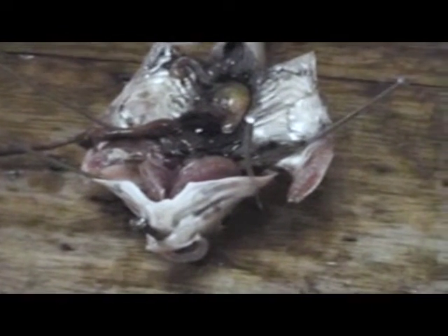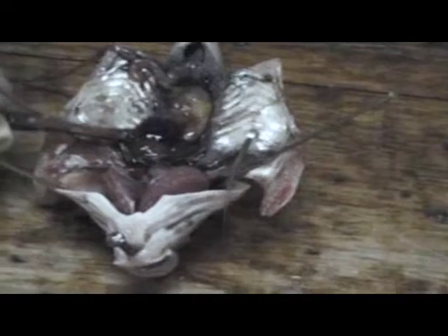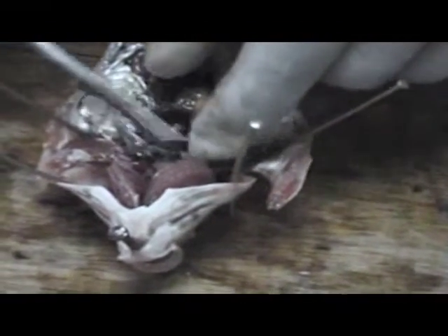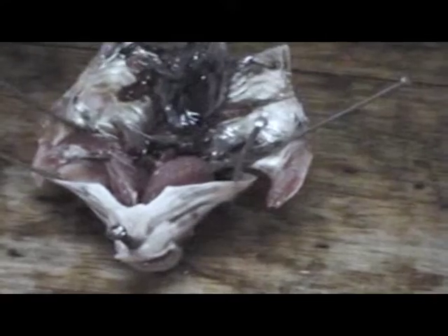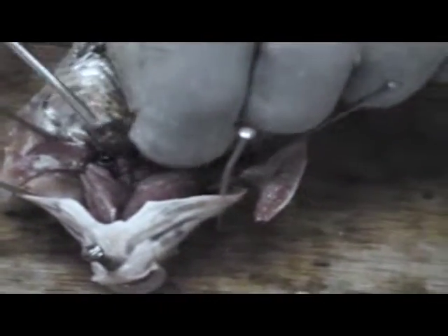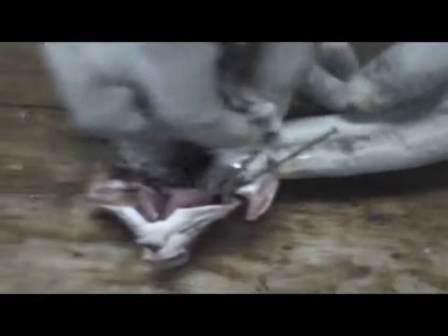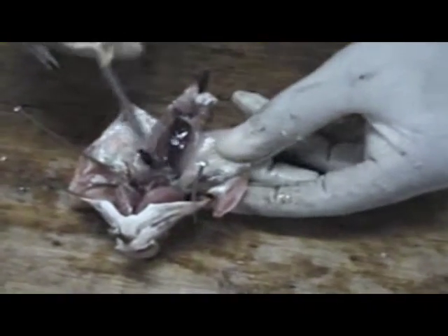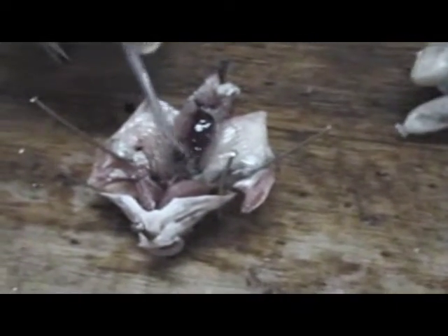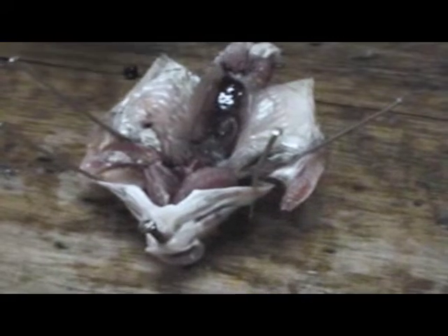We are going to display the urinary system of this fish. This is the swim bladder — this part here. When the fish takes up air, this part will be filled with air and the fish will be buoyant and can float on the water. But when it sends out air, the swim bladder goes down and the fish becomes heavier and sinks to the bottom.